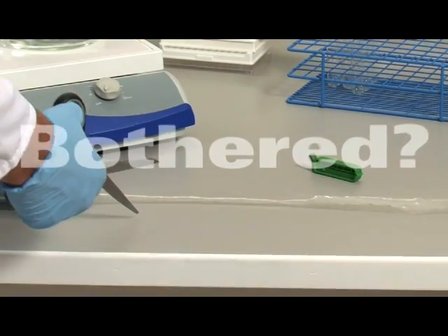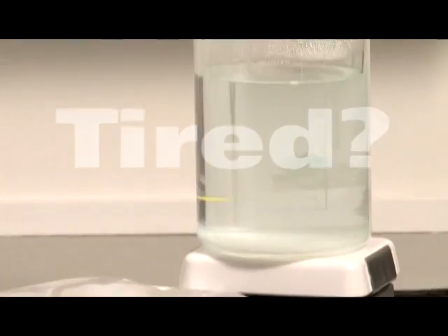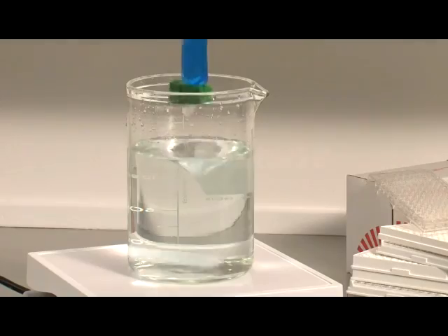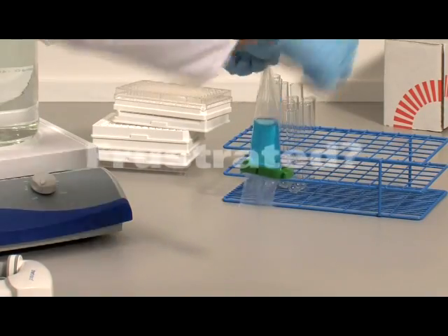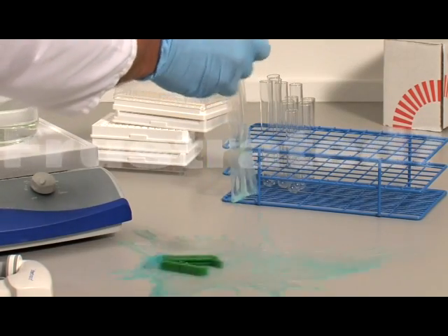Bothered by slick, curly rolls of dialysis tubing that are difficult to open? Tired of waiting for the water to boil before processing samples? Plagued by clips that just won't stay put? Frustrated with slippery bags spilling your samples?